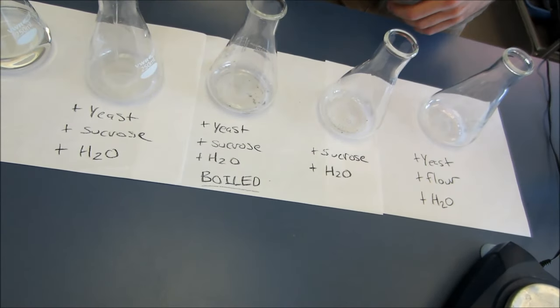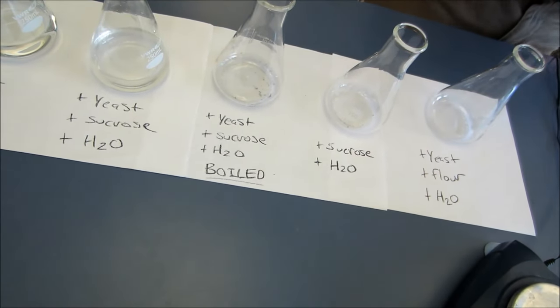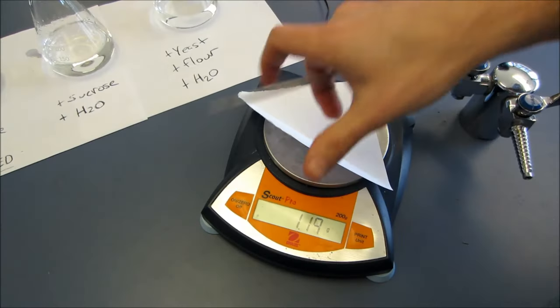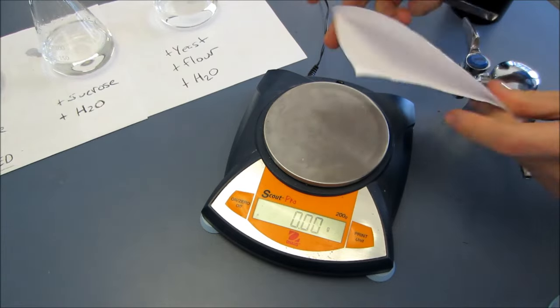Every flask is going to get water just to provide an environment for the yeast to live in. They're all going to get 100 grams of water. It's from the same source, it's the same type of water, same temperature, all that.